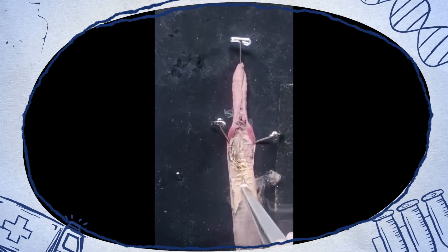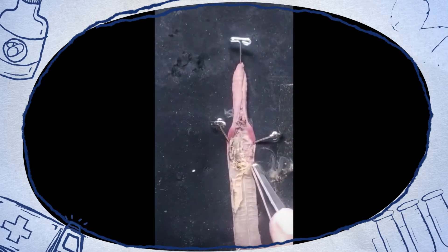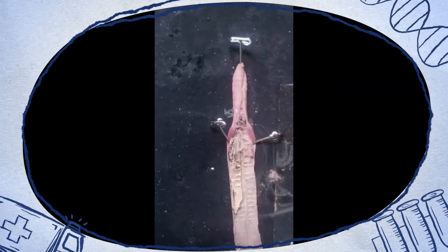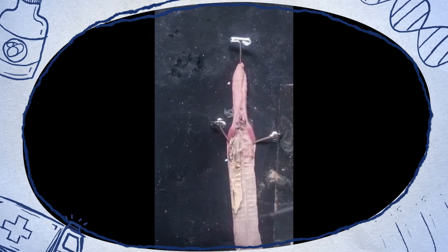As the digestive tract is being removed, you can locate the nervous system on the ventral side.